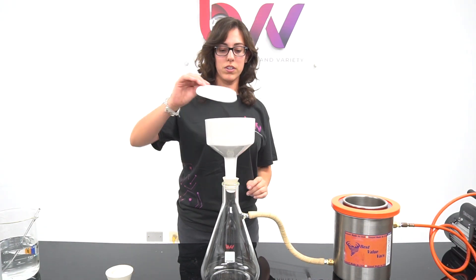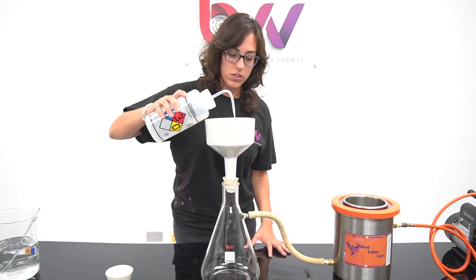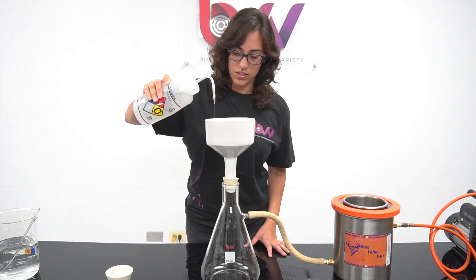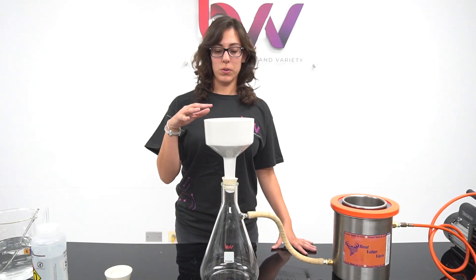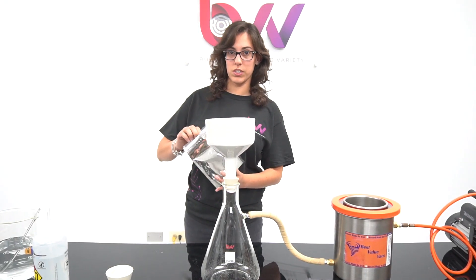We take our filter paper and use our solution to wet it. Once the filter paper is wet, we turn on our vacuum. I'm going to add some powder into our solution to filter it out.